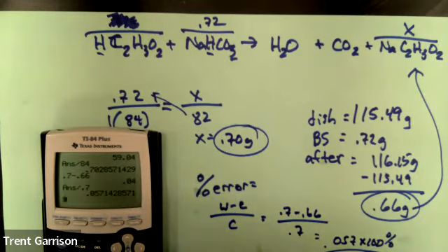All right, so I am going to turn this back over to you now. So it is your turn to do this laboratory.